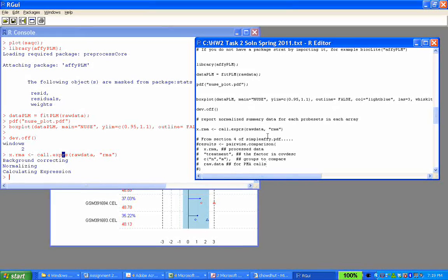So now you're going to do some pairwise comparison, which means that you're going to take each probe set at a time for each array, and you're going to group it by a condition. So you have 5 arrays that belong to the lean condition and 5 arrays that belong to the obese condition, right? So you're going to group the values of your 5 arrays for one probe set. You're going to compare, for gene 1 let's say, the first 5 arrays that belong to the lean condition with gene 1 on your second set of 5 arrays that belong to the obese condition.